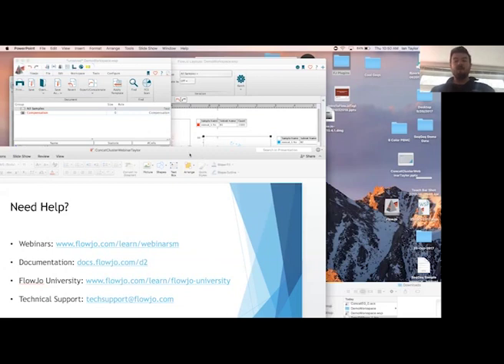Yeah, so asking about applying the operation in a new workspace. You shouldn't need to. I think this is in reference to the previous question, but yeah, you can apply t-SNE at any point in your gating hierarchy, and it should be fine. But if you make adjustments to that gate, then you're going to have a recalculation problem potentially.